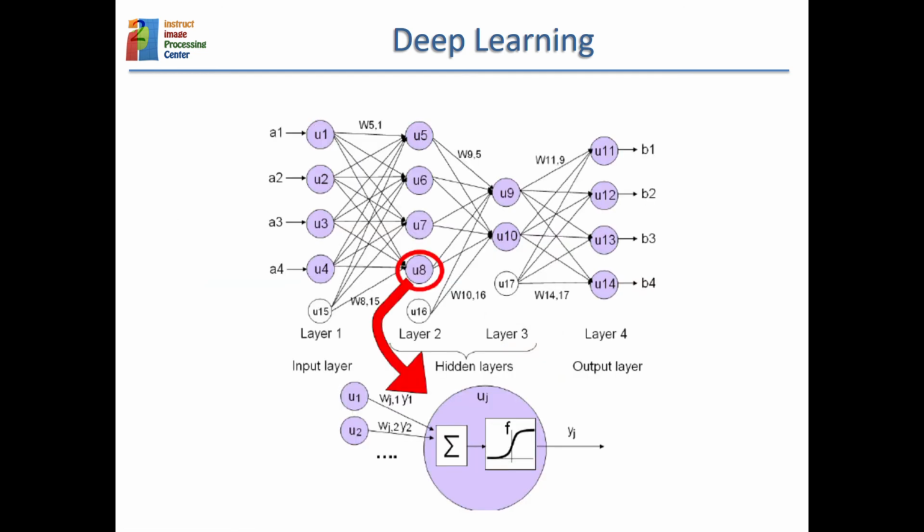And you can be very creative about the way you construct neural networks, because we have seen just one neuron. Each one of these circles would be a neuron. You have the neurons at the input, but then these neurons may be connected to some other neurons, and these to more neurons, and each one of these sets of neurons is a layer.